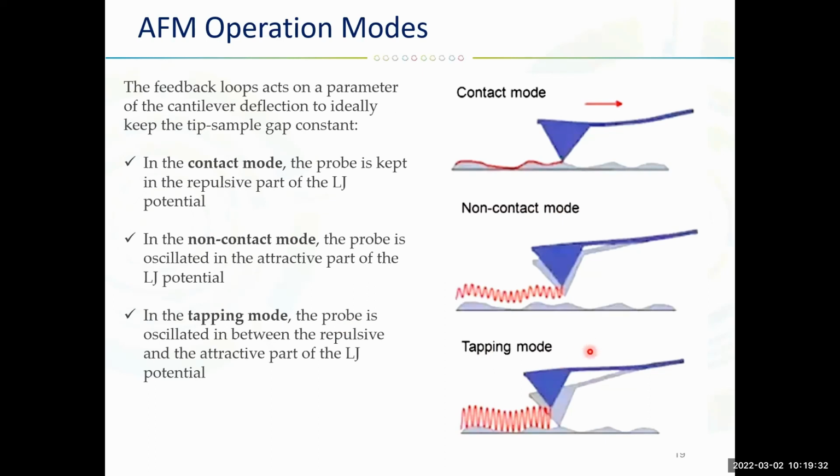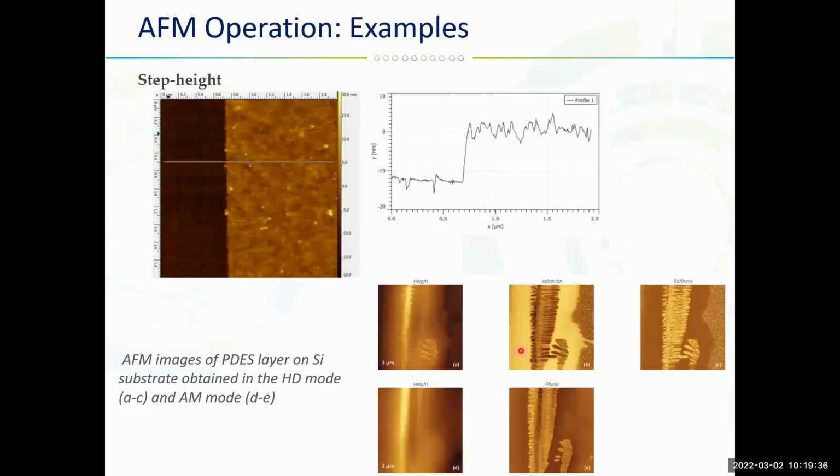Okay, and here are examples of AFM operation. This is how the profiles usually look, especially when you have step height measurements.